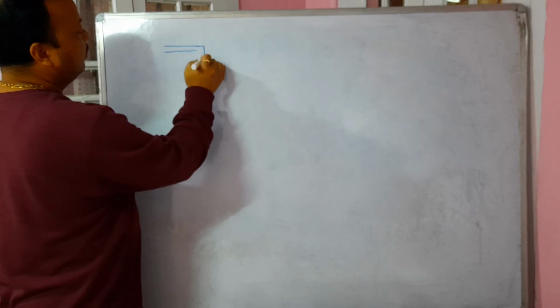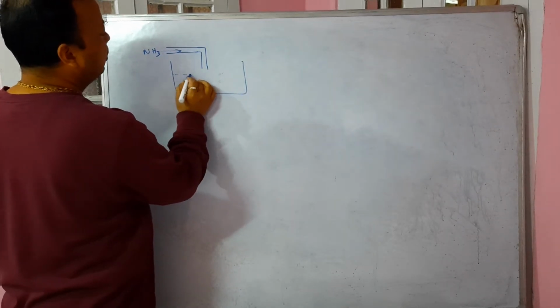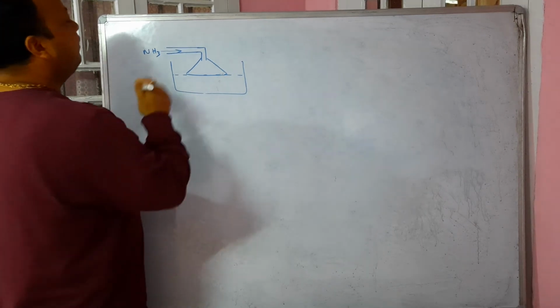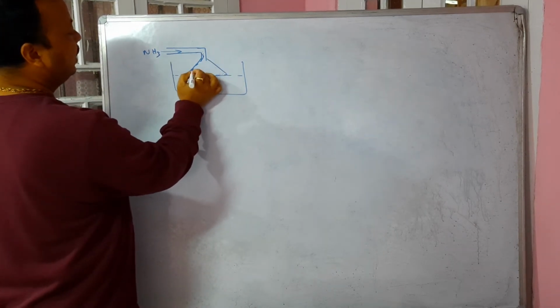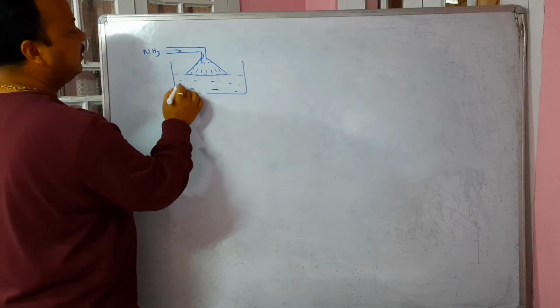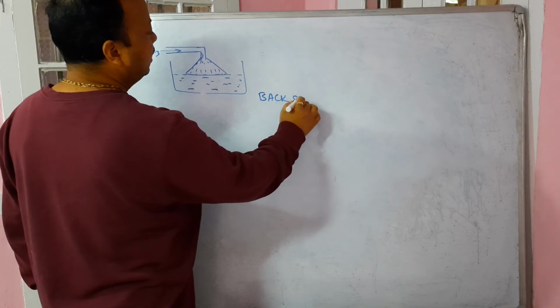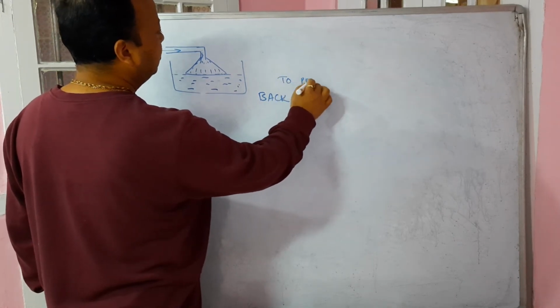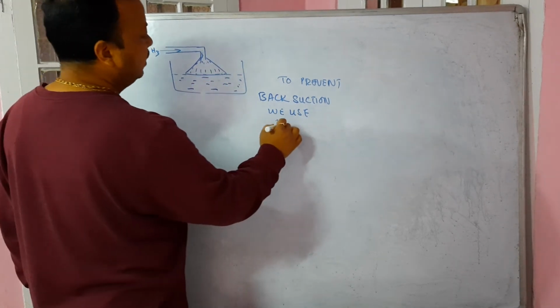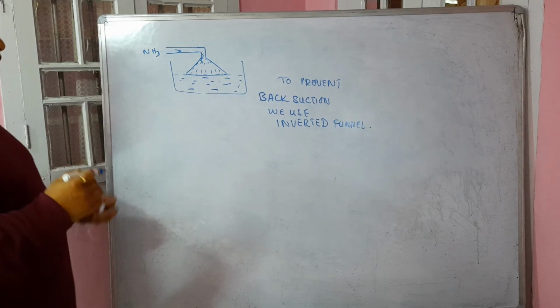So let's say this is from where we are producing the ammonia, and this is where we are collecting it. We have to ensure that we have an inverted funnel. With an inverted funnel, whatever ammonia is produced will first trickle down all the locations of the funnel, and only then will the absorption, the dissolving process, start. But if we don't have the inverted funnel, it will cause back suction. So to prevent back suction, we use an inverted funnel. This is how we create the aqueous solution of ammonia.